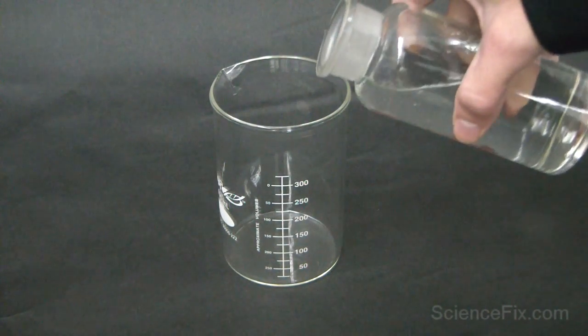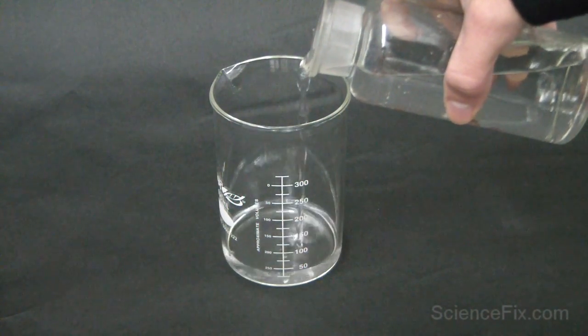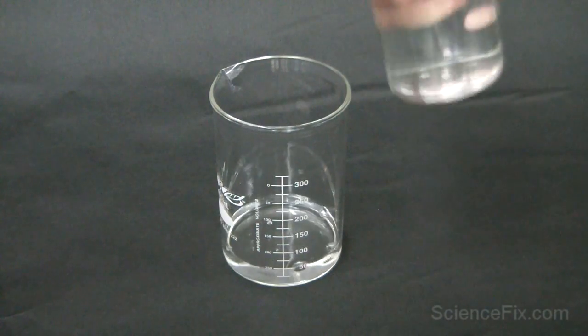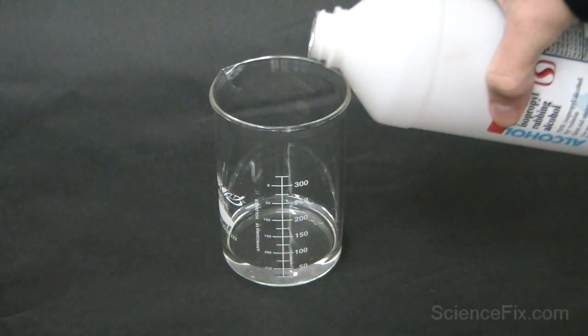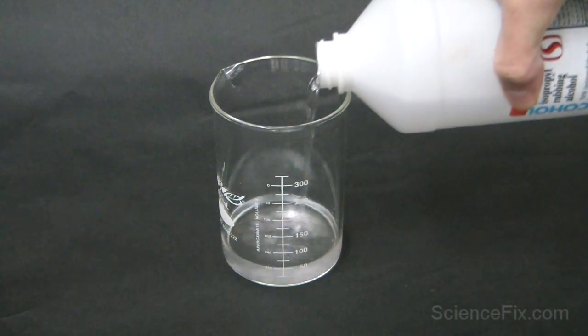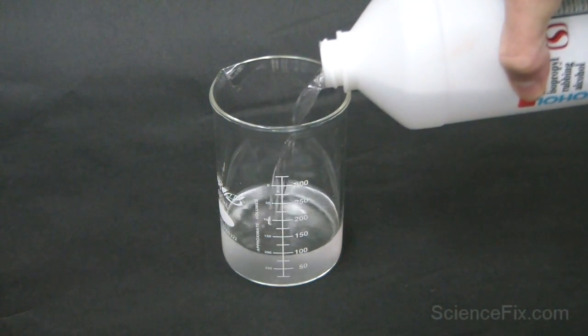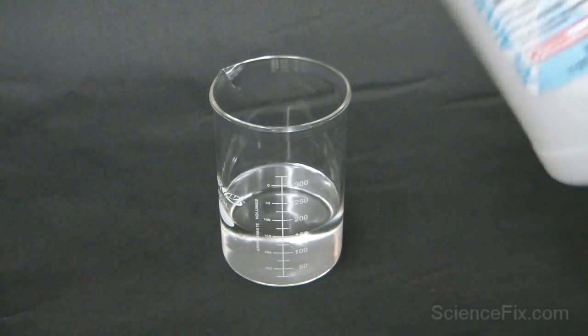In the beaker goes 50 milliliters of water. Next, 100 milliliters of isopropyl alcohol goes into the beaker. So it's about two parts isopropyl alcohol to one part water.